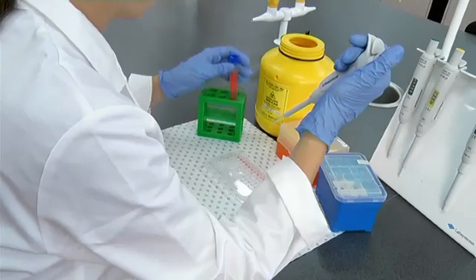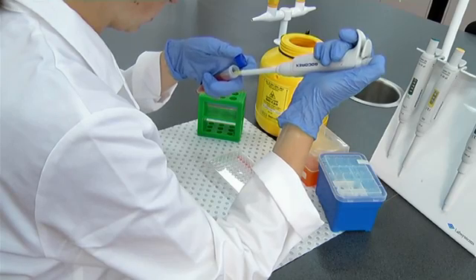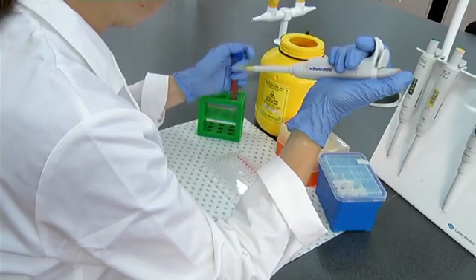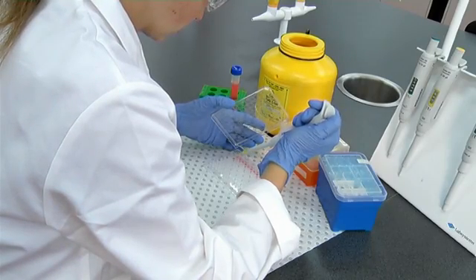Automatic pipettes are routinely used in the laboratory for accurate and precise handling of small quantities of liquids, typically volumes less than 1ml. Automatic pipettes work by air displacement. When the plunger is depressed, a shaft inside the barrel of the pipette is pushed forward, displacing a precise amount of air from within the barrel.